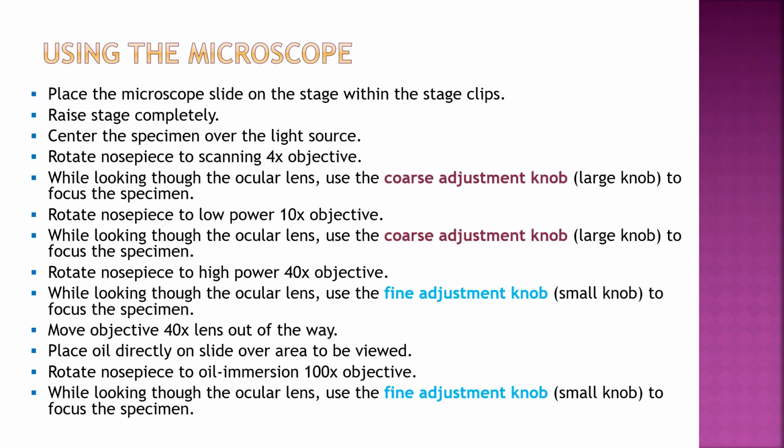All right, so you're going to place the microscope slide on the stage with the stage clips. That's the first thing you're going to do. You're going to handle the microscope slide by the edges. You don't want to put your fingers on the middle of the microscope slide. Then you're going to raise the stage up completely.